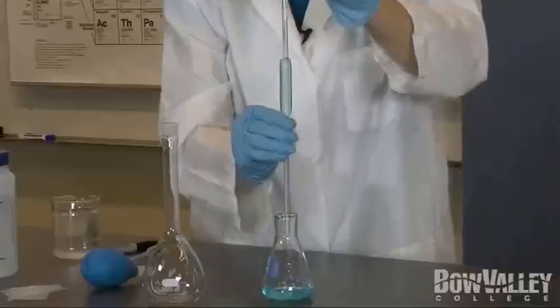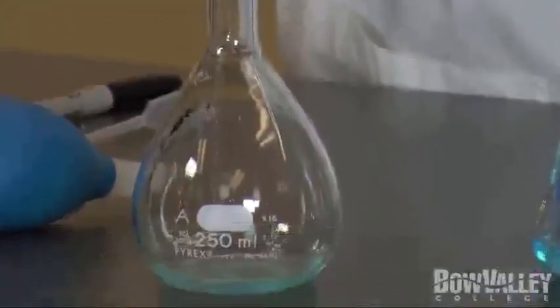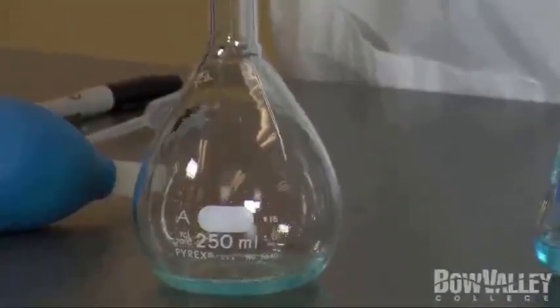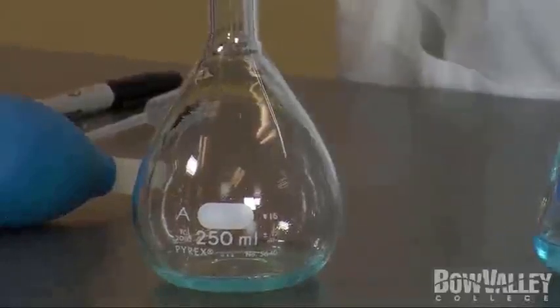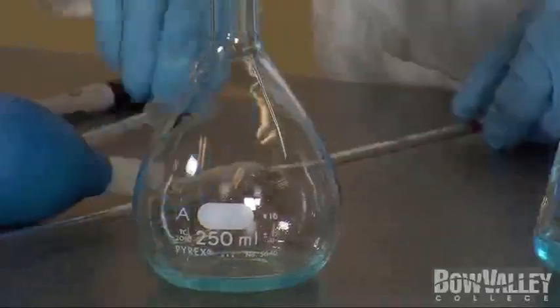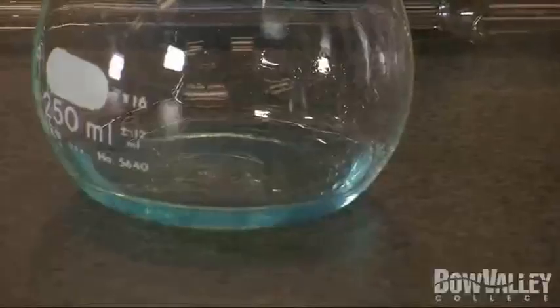Once you have the required amount of liquid, pull the pipette out of the Erlenmeyer flask and insert it into a new 0.250 liter volumetric flask. Remove your index finger from the end of the pipette and allow all the liquid to drain into the flask. Don't worry if a few drops remain in the pipette. These are calibrated to deliver the exact amount of liquid required.